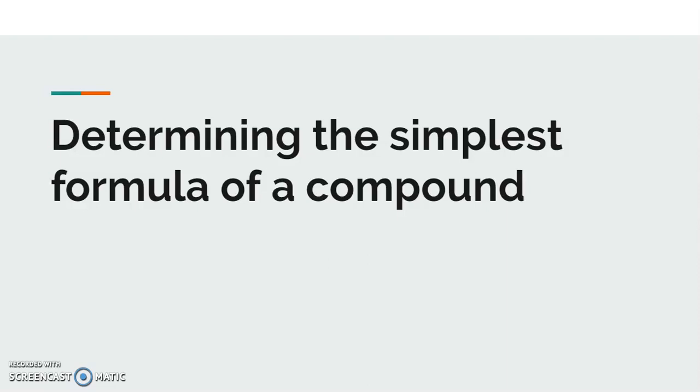Okay, so welcome to our lab for today. We unfortunately can't be actually doing this lab in class, so we're going to do a virtual lab. I'm going to walk you through the steps, and you're also going to look at a YouTube video that demonstrates the experiment, and then you're going to work out the questions as you normally would. So we're going to determine the simplest formula of a compound.